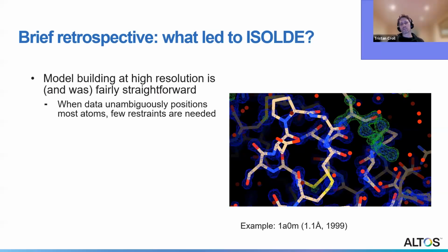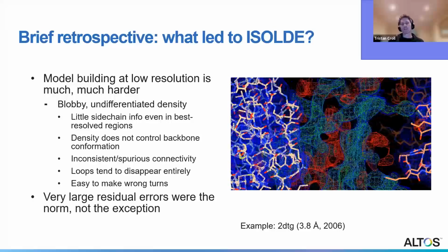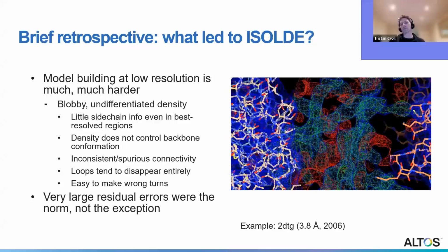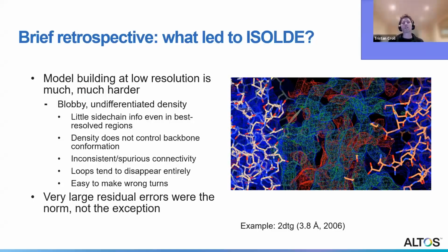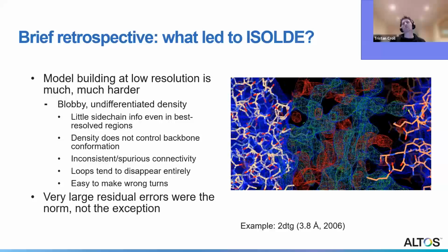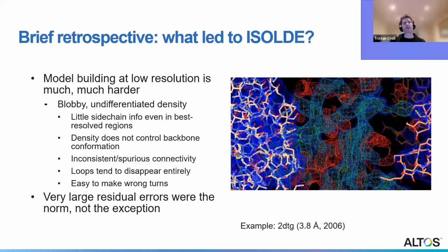Now, this wasn't the sort of data I started with or stumbled my way into. What I started working on in a roundabout way was the 3.8 angstrom crystal structure of the insulin receptor. And of course, at the time, I had no idea of even how to generate an electron density map from structure factors. So I had no way to see the model in its density. And from that outsider's perspective, I distinctly remember thinking, well, 3.8 angstroms, 3.8 by 10 to the minus 10 meters, that's tiny. That model must be pretty good. And of course, that is very, very far from the truth.